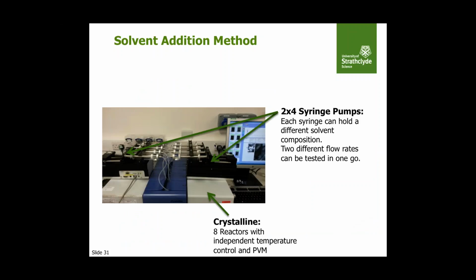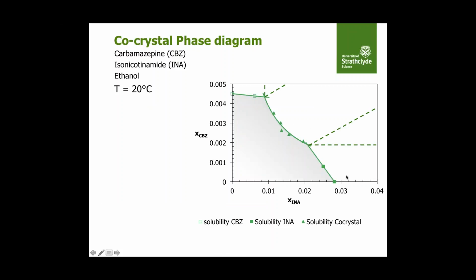So we used the Crystalline for these measurements, and we equipped it with syringe pumps, and each syringe can hold a different solvent composition and can feed into a different vial. And we can have various flow rates.